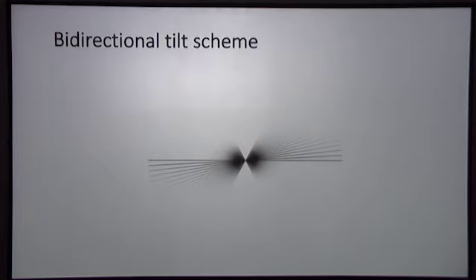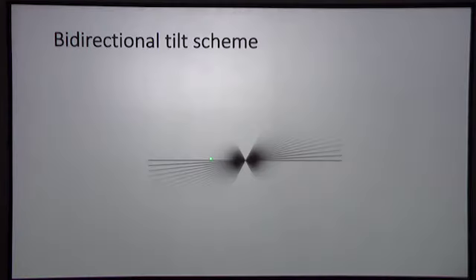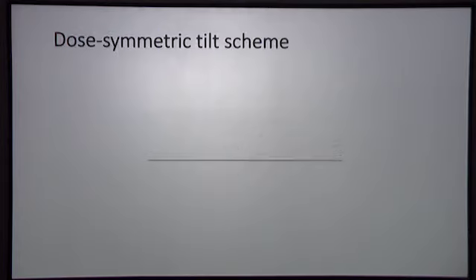And the various distortions have accumulated in the sample due to exposure in this time. And when we jump back, the sample image at this angle and at this angle may be different to one another. And you can actually see that. I'll come back to it.